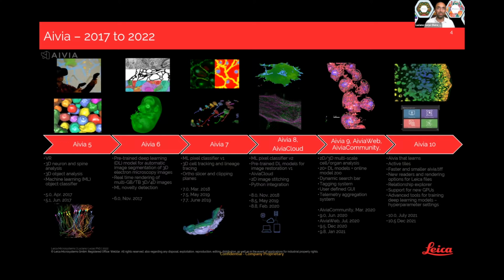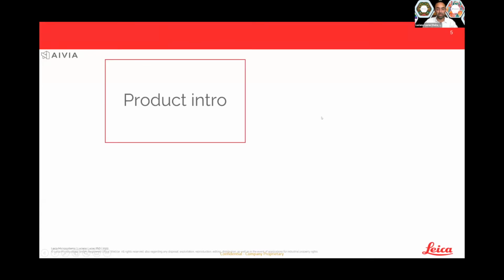The real distinctive feature is about using AI for a lot of the more challenging tasks, both on segmentation and classification or phenotyping, as you might wish. But I will park it there. I didn't really want to talk about the product for the whole time. I really wanted to talk about a concept that we started to explore about 2 years ago. And now we feel pretty excited about.